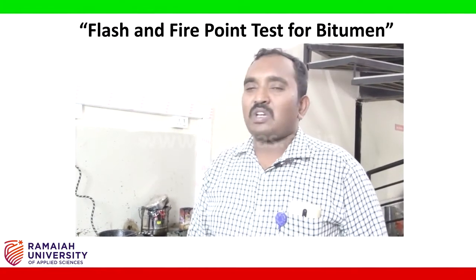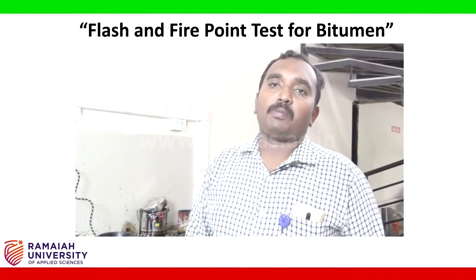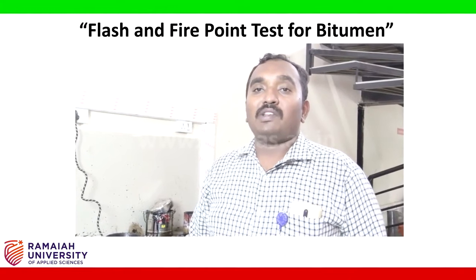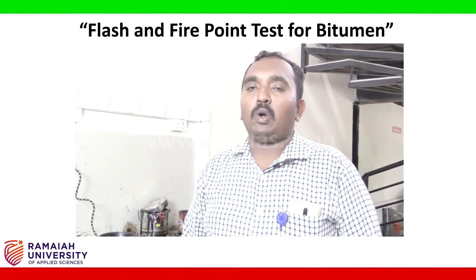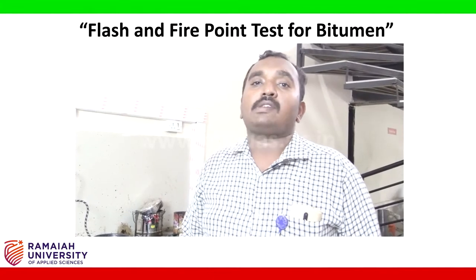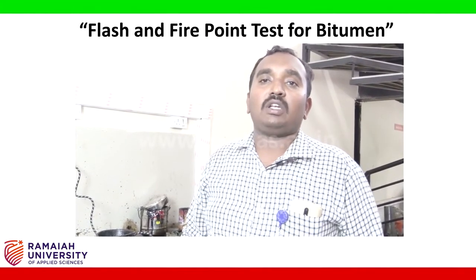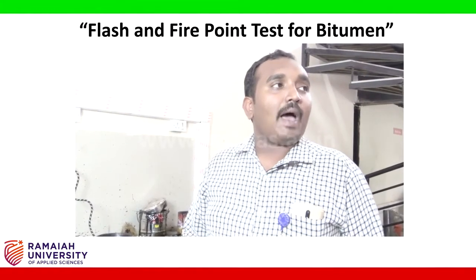You may ask a question, why is this flash and fire point required? When we are heating the bitumen for preparing the bituminous mixes, we should know what is the maximum temperature a bitumen is supposed to heat up to. If we don't know that, if we simply keep on heating, if it crosses 350 or 400 degrees centigrade, your bitumen behaves as an explosive. So that's why we are supposed to know the maximum temperature that you are supposed to heat up the bitumen.